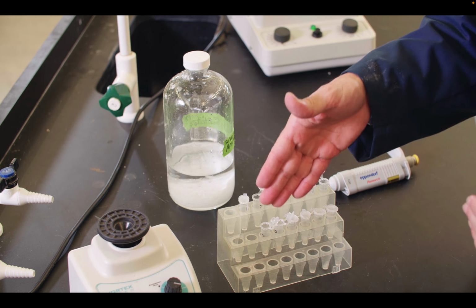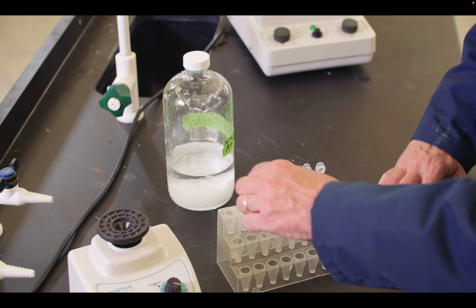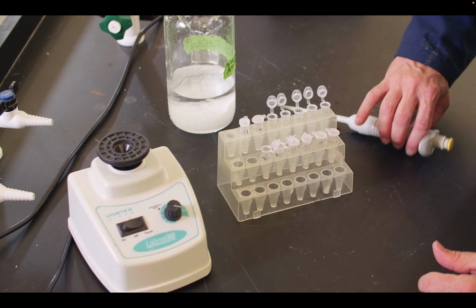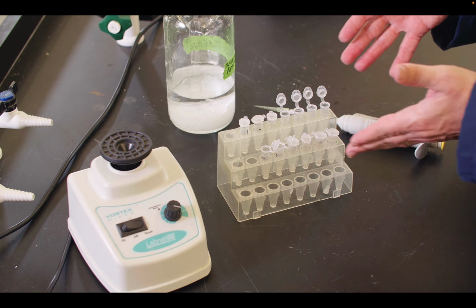So how we do this is we have to add small amounts from here into there to get this to work. I like to do it in small amounts, about 20 microliters or so, and so I'll pull up some of the ammonium sulfate solution, which we've already aliquoted into these tubes, and then I'll add it to this tube one at a time, and close the cap, and then vortex it. I'll leave the cap closed, to let me know that I've already done that one, and then I will do the same thing for number 3. 20 microliters, vortex it, and continue on. Again, one of the reasons we can't just add it all at once is that it needs to be slow.